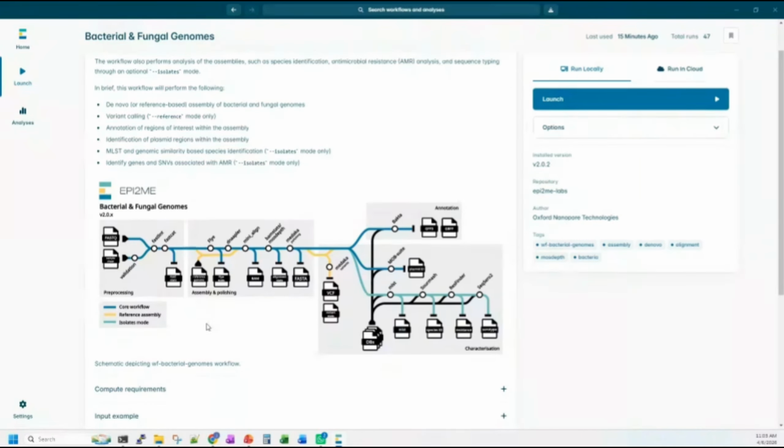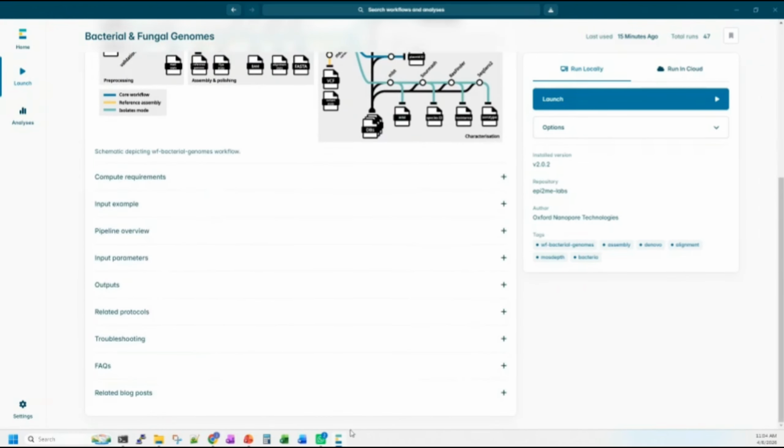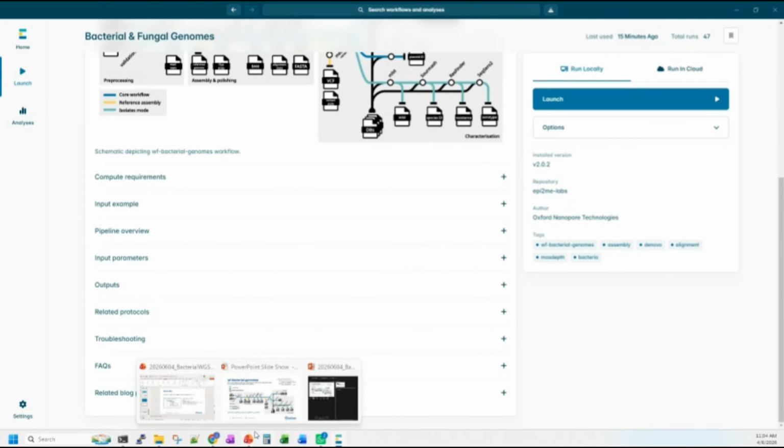You can see the stations over here. The same pipelines can also be used for other microbes, including fungus. If you have more specific samples or applications, you can also check with NextGene, or check with me, on how to proceed with the data analysis accordingly. I think that is all for the demonstration.